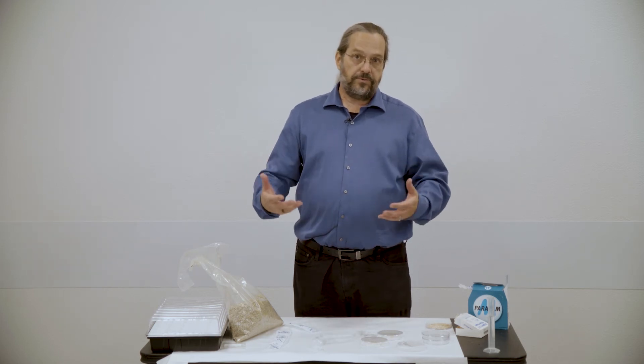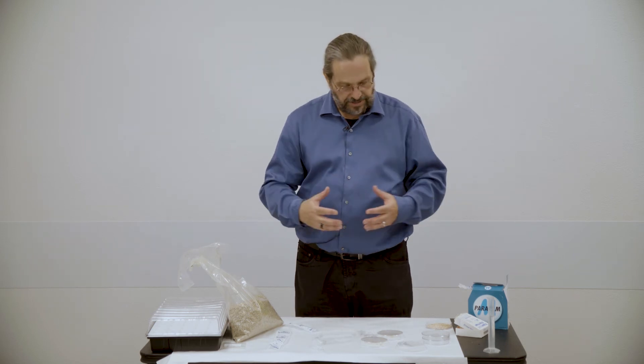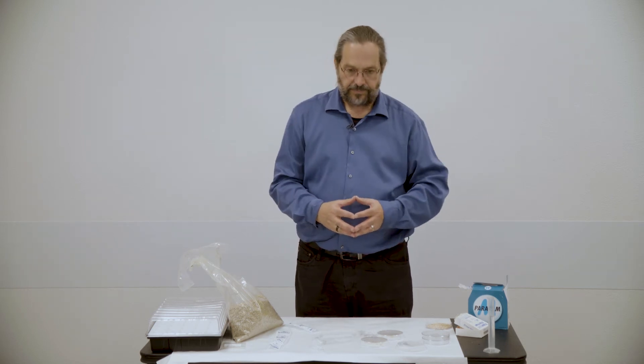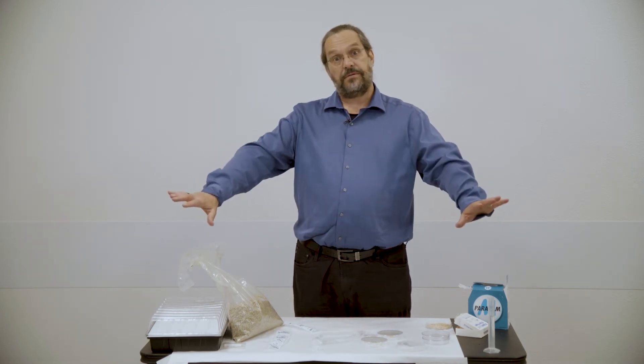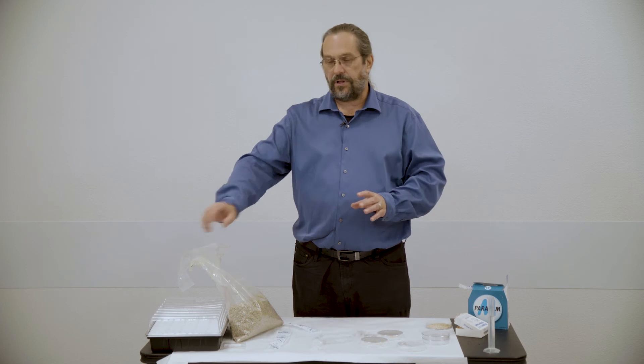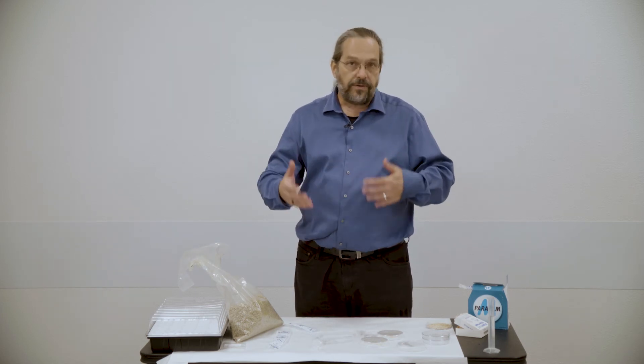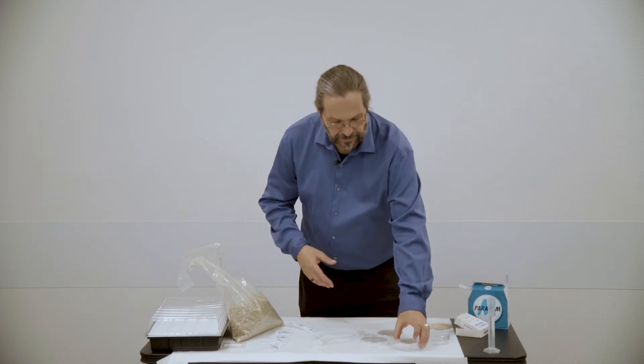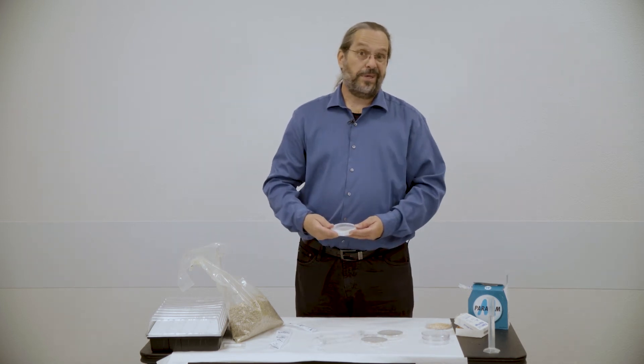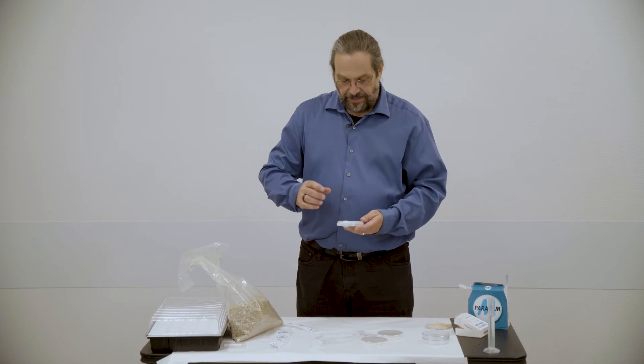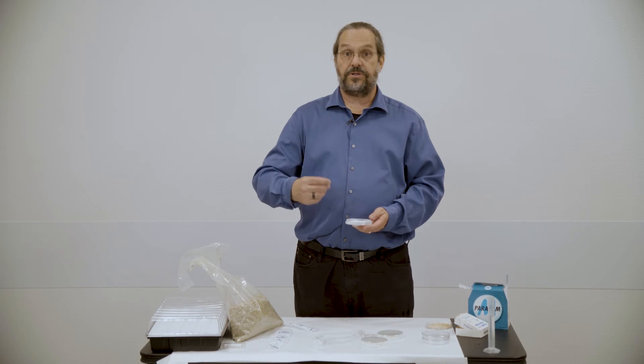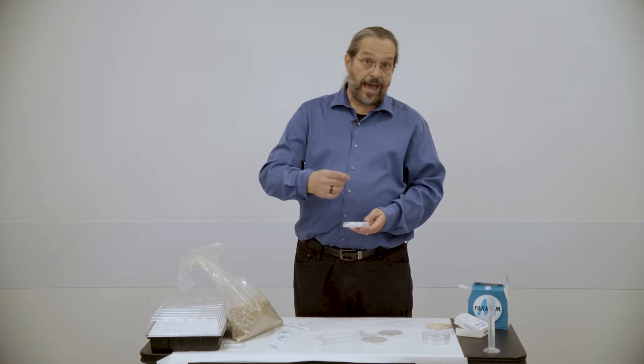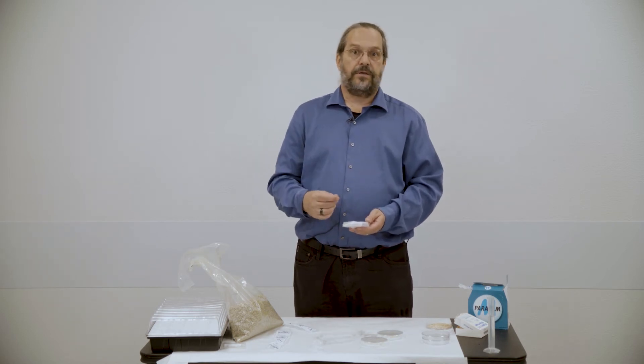What you can also do though in a situation like this is let's imagine you get 100% germination across the entire study, right? All of your controls, all of your experimental. The students are going to be really concerned because they don't have good data. One of the neat things about leaving this petri dish for a week and letting the seeds germinate is that you're not going to have so much biomass as hard to measure. And so you can actually have students measure the shoot length or the radical, which is the embryonic root tip length, and look at those.